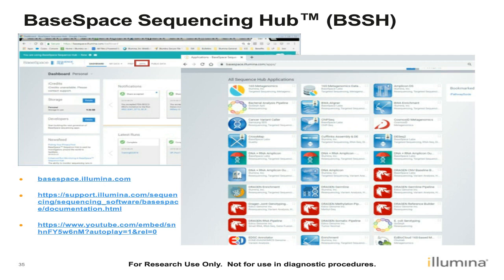Again, just a link to BaseSpace. You can create your account or just browse around and take a look. And of course, we have some webinars too to guide you through going through BaseSpace and how to use it.